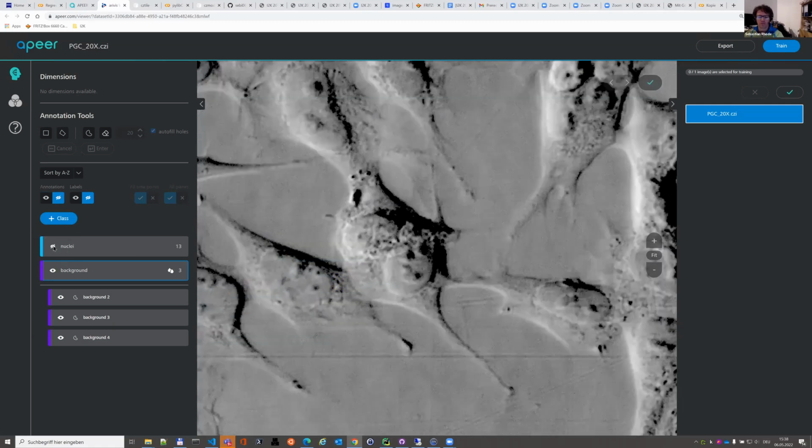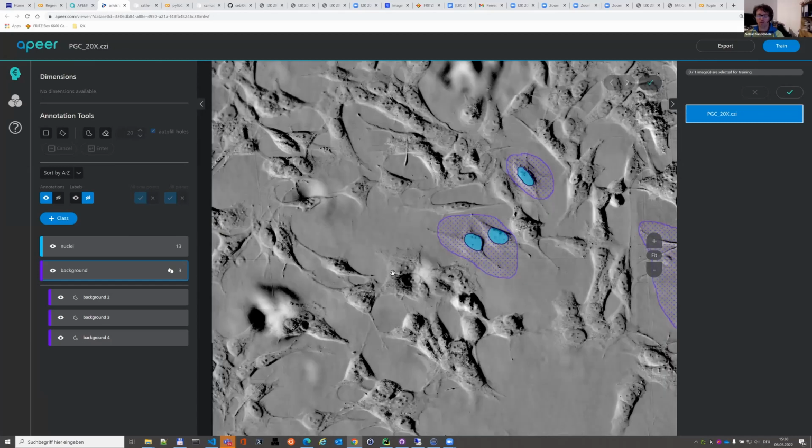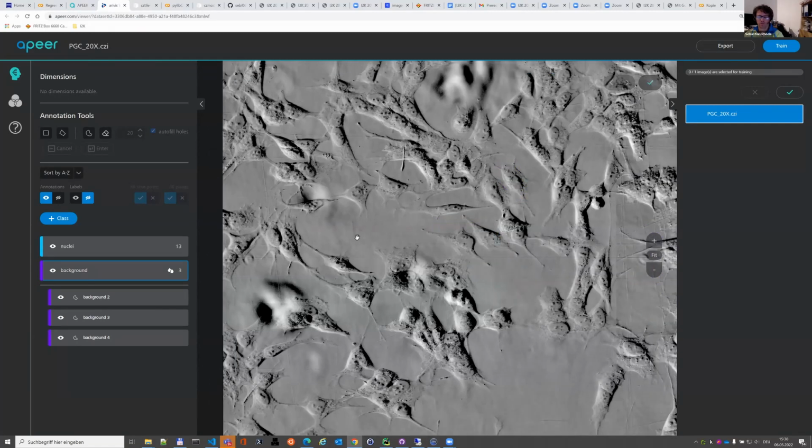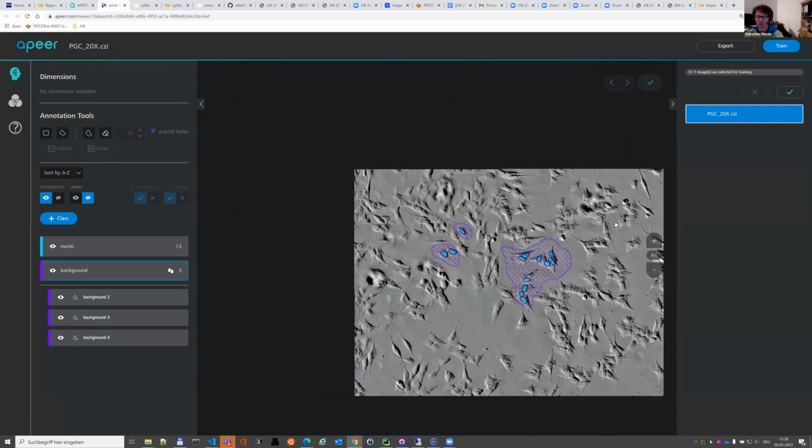See, and this is very easy to label the edges pixel precise. And you don't have to label the whole images. Stuff you are not labeling is just discarded. So what we encourage people is rather label a few objects and label on more images, instead of spending a day to label every individual nucleus, because it doesn't really help.